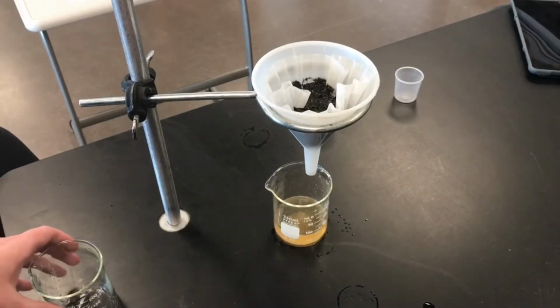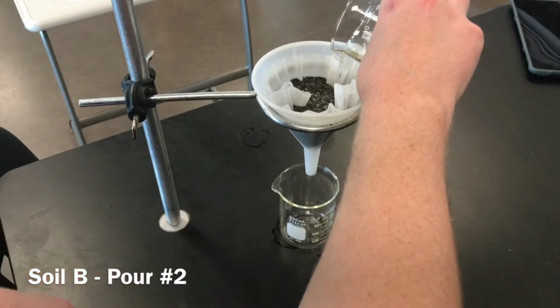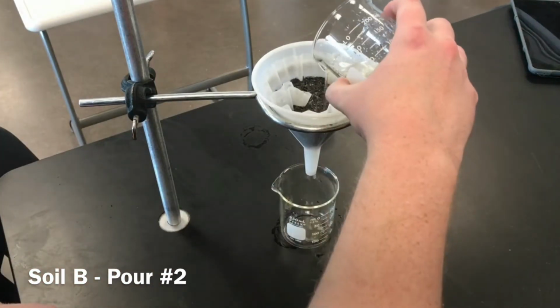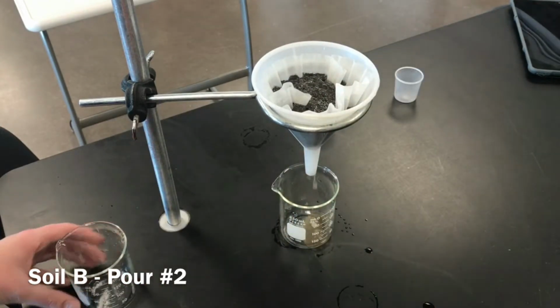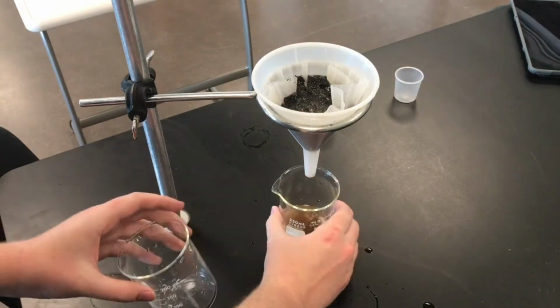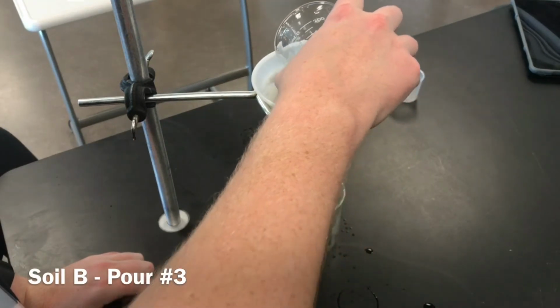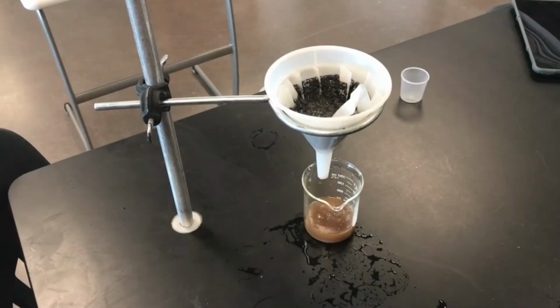Looks good for the first filter. Again, we're going to do this 3 times. So I'll run it through 3 times. All right, I'll run it through one more time here. And it's very possible that this last one will take quite a while. So just be patient as it filters through the very end here. Well, all right, looks like it's finishing up here.